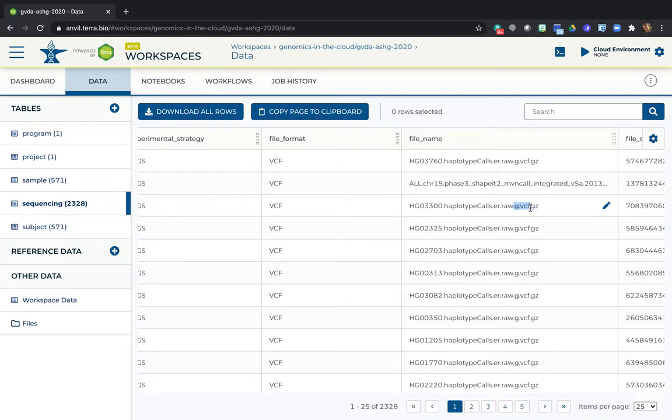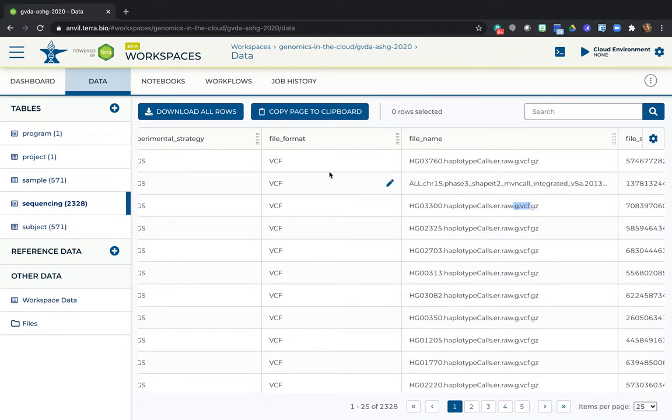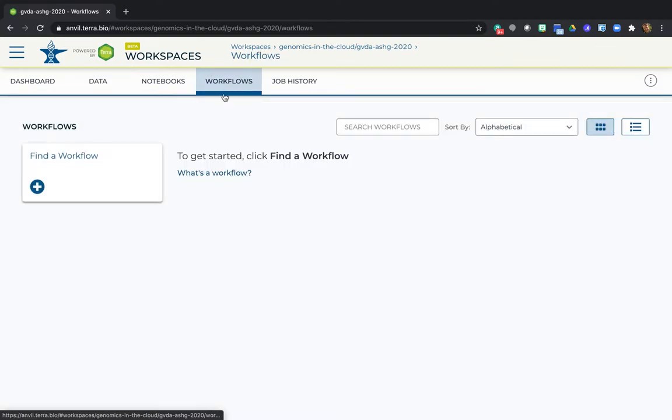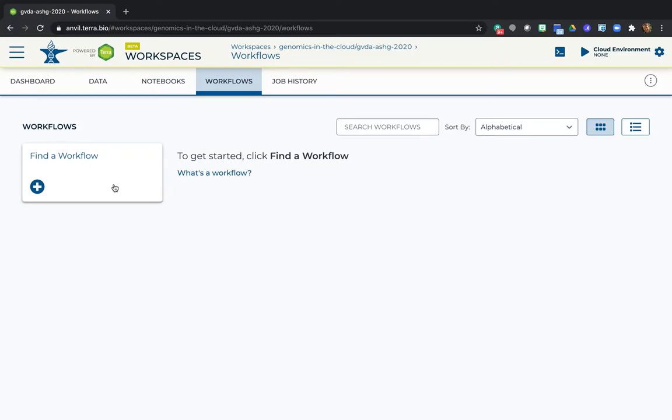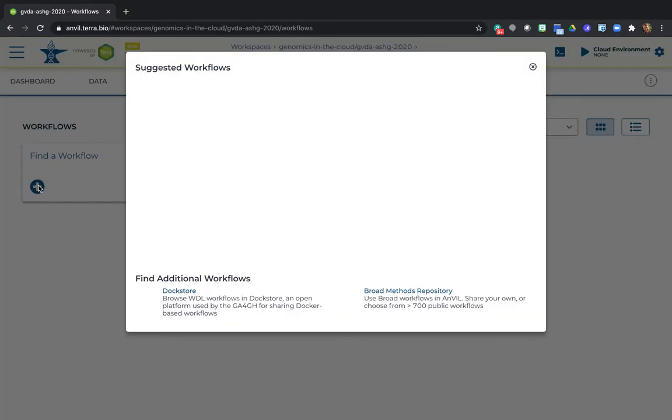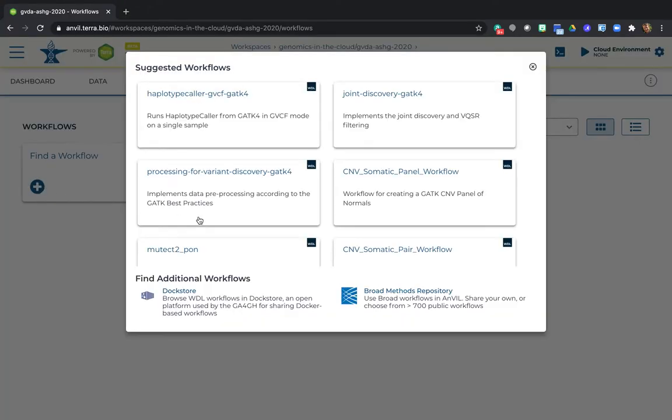I'm going to show you how to find a joint genotyping workflow in Dockstore to try it out on the 1000 Genomes data. So let's head over to the Workflows tab, which is currently empty. In the box that says Find a Workflow, over here on the left, click the big plus sign. That opens a dialog window with a list of popular workflows.